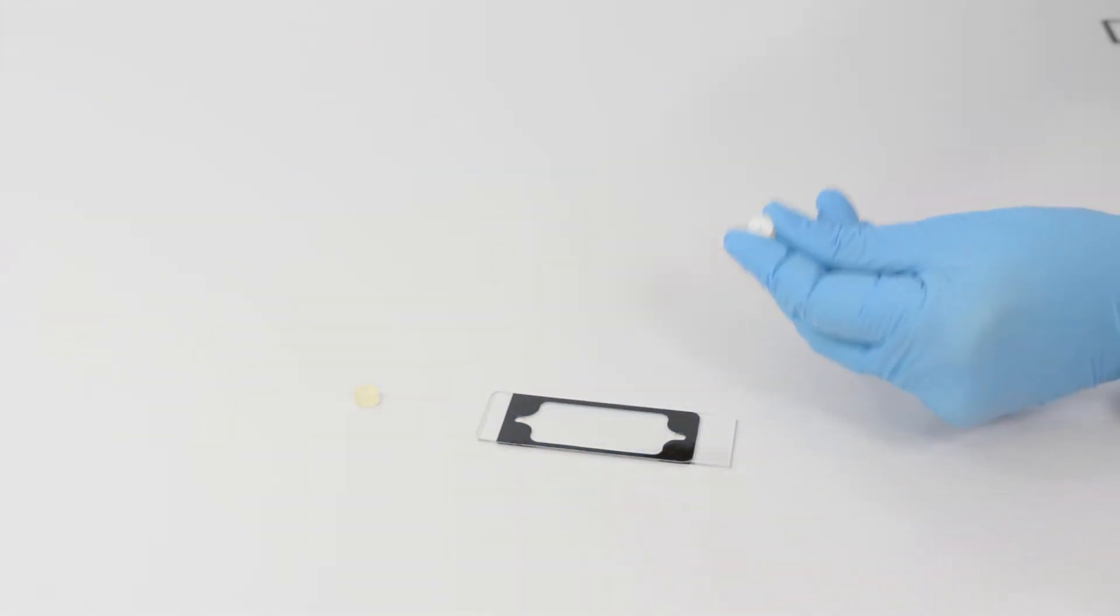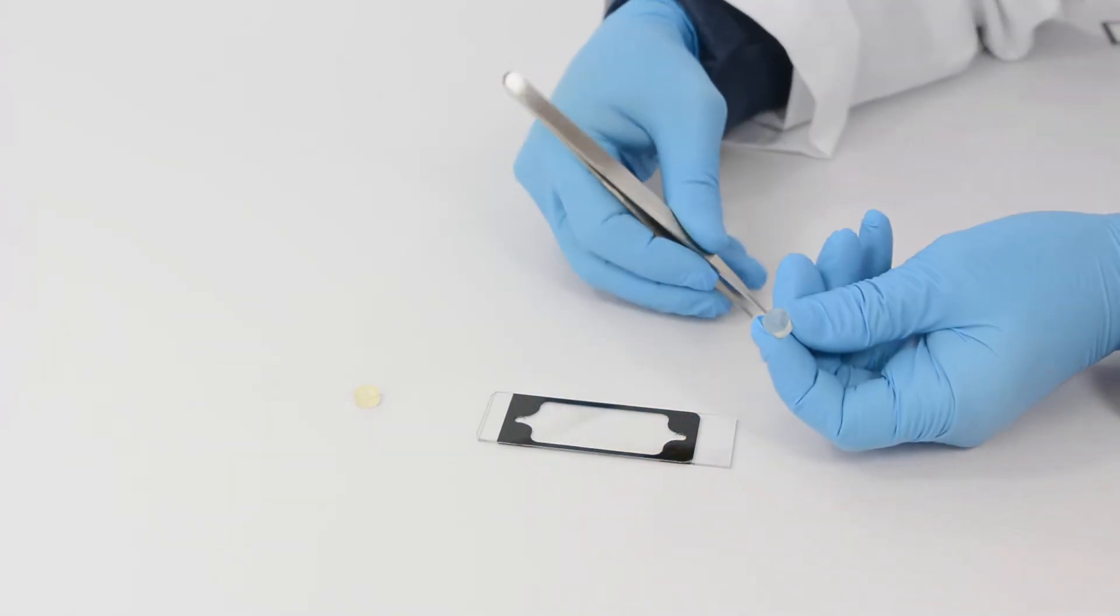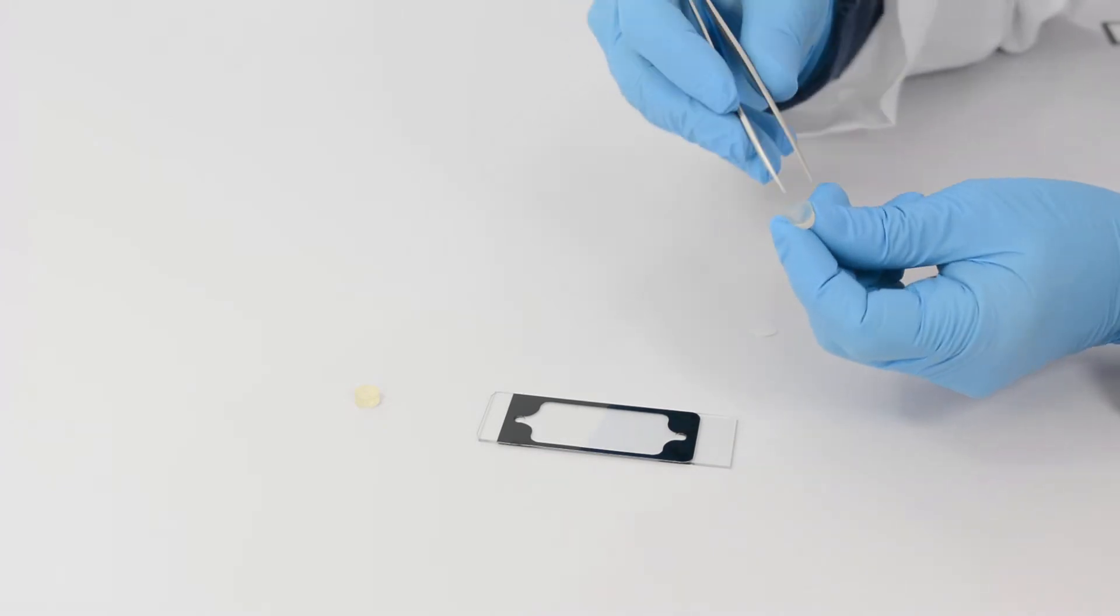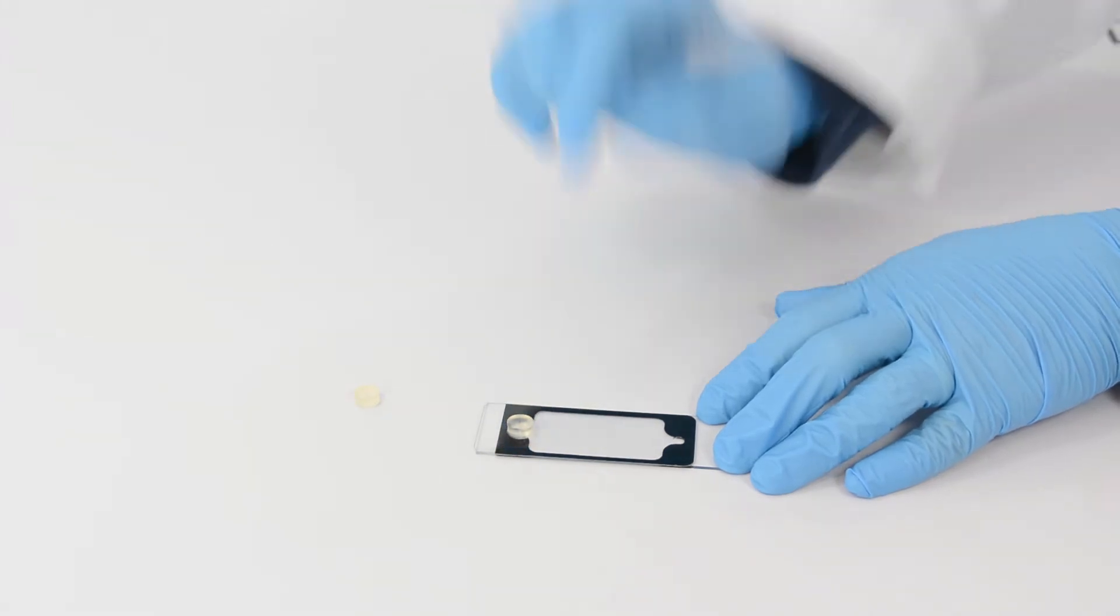Apply thin tubing connectors over each loading port, removing the paper lining first, then applying the tubing connector over the port with the adhesive side facing down.